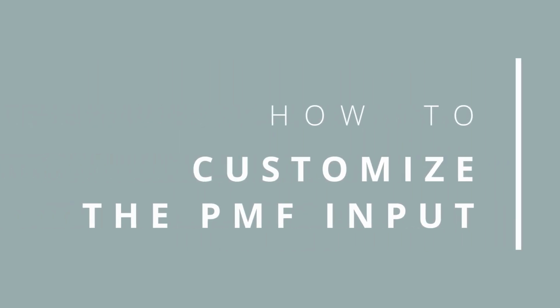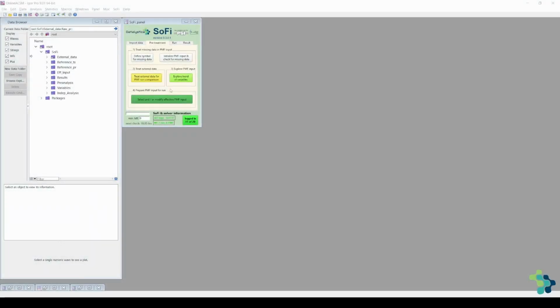Today I'm going to show you how to customize your PMF input. Sometimes you might want to run PMF just over a certain time period, or you realize that some variables should be excluded from the analysis. To achieve this, one has to delete the corresponding rows or columns from the data and error matrix. Doing this manually can be very tedious, so we developed a tool where you can easily blacklist data points or periods with just a few mouse clicks.